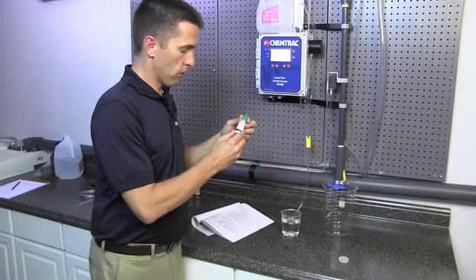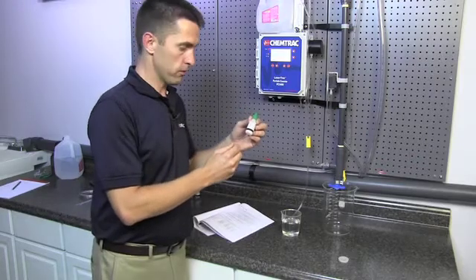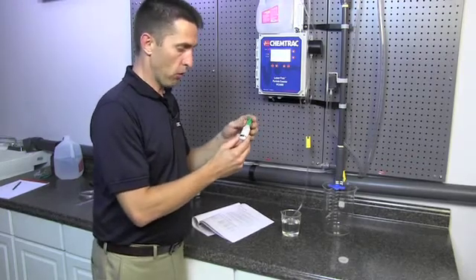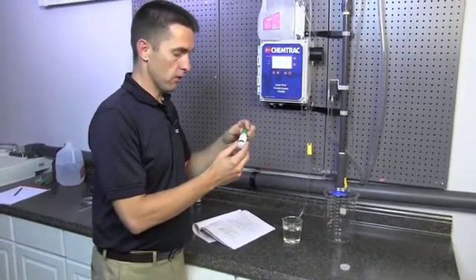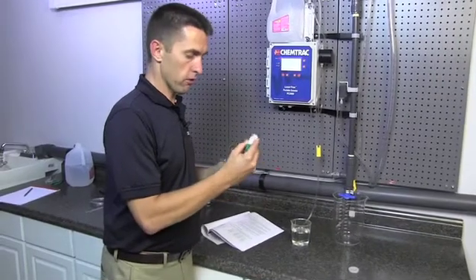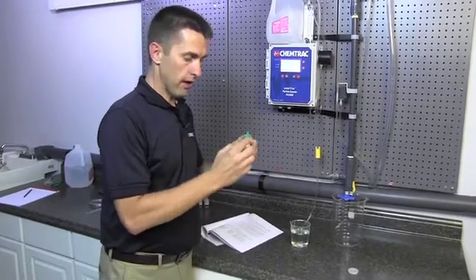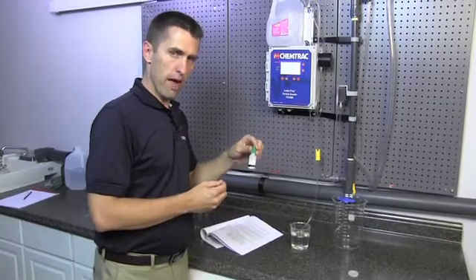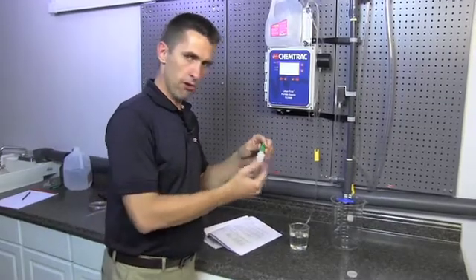So we're going to take our 2 micron PSL spheres. And the first thing that we need to do before we pipette this into the jug is we need to gently stir the jugs for a bit of time.